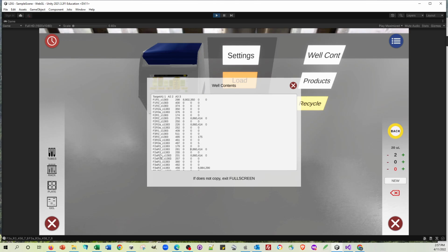So we've got extra forward binding sites, that's what this A represents here, and we've got extra reverse binding sites. And in fact, they can apply in combination. So here we've got the extra forward one and the extra reverse one as well. And because these primers were present in the tube, we've got tons of that amplicon as well.